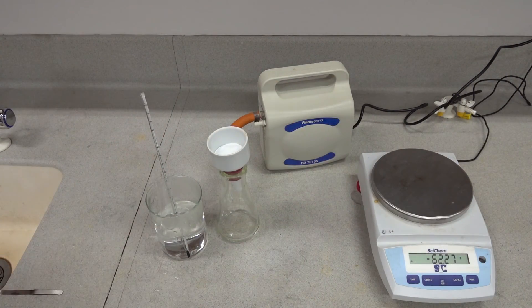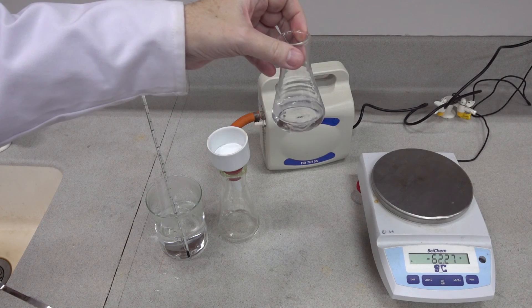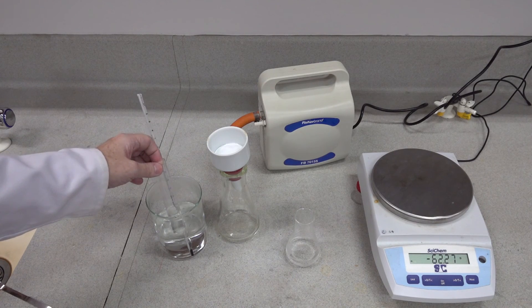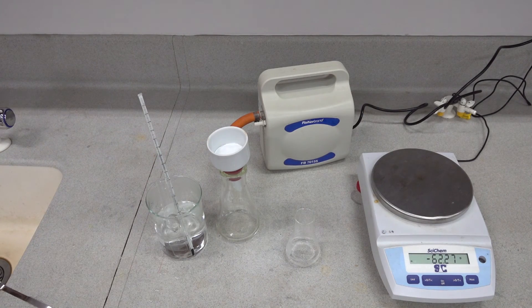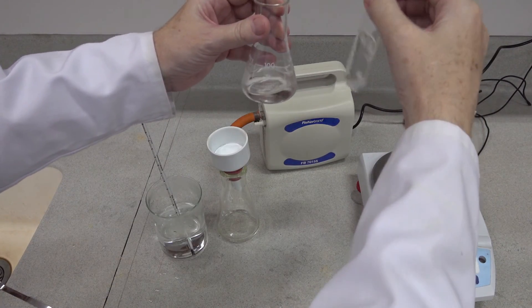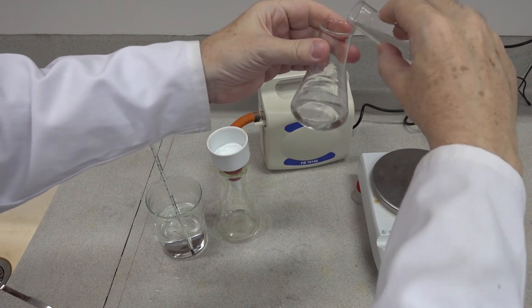So we've dissolved our crude product in the ethanol through crystallisation — the product and the impurities have dissolved. The next thing we need to do is crystallise the material out again. We've got about 40 cubic centimetres of cold water here in the conical flask. The next stage is to pour the solution of aspirin and ethanol into the cool water, and you should be able to predict what is going to happen.